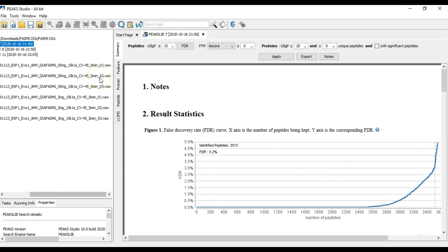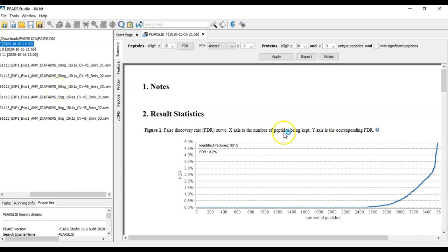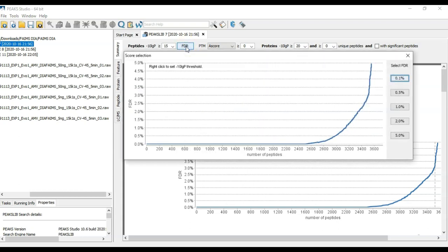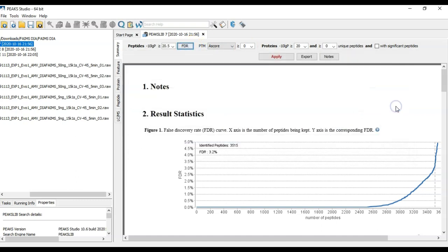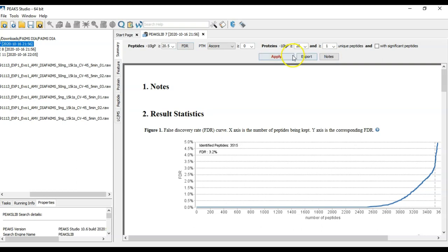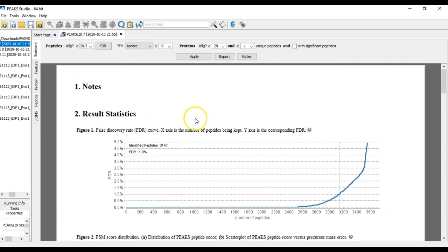Here we're looking at a few different replicative samples with 5 nanograms of protein versus 50 nanograms of protein in order to see how this software is able to replicate the ratio. Here we can look at the identification results. You come up here to the top, click the FDR button, pick an FDR cutoff. Then you can also set protein and unique peptides per protein filters.